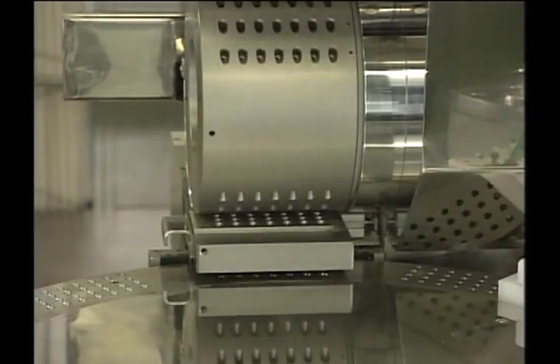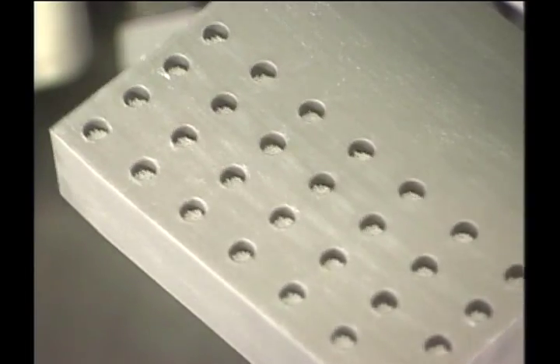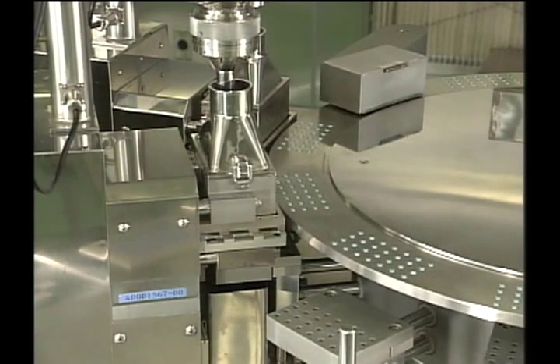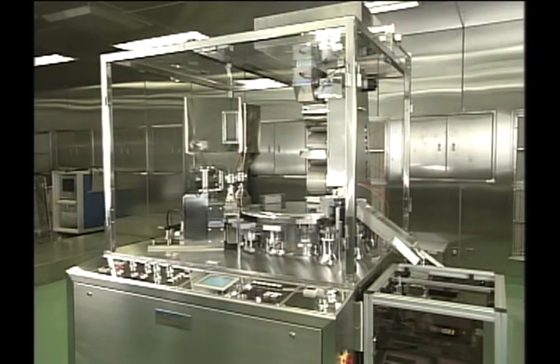The LiqFill Super 80 was developed based on our flexible ideas and reliable technology. In compliance with current needs, QualiCaps will always continue to develop more advanced machines. Thank you.